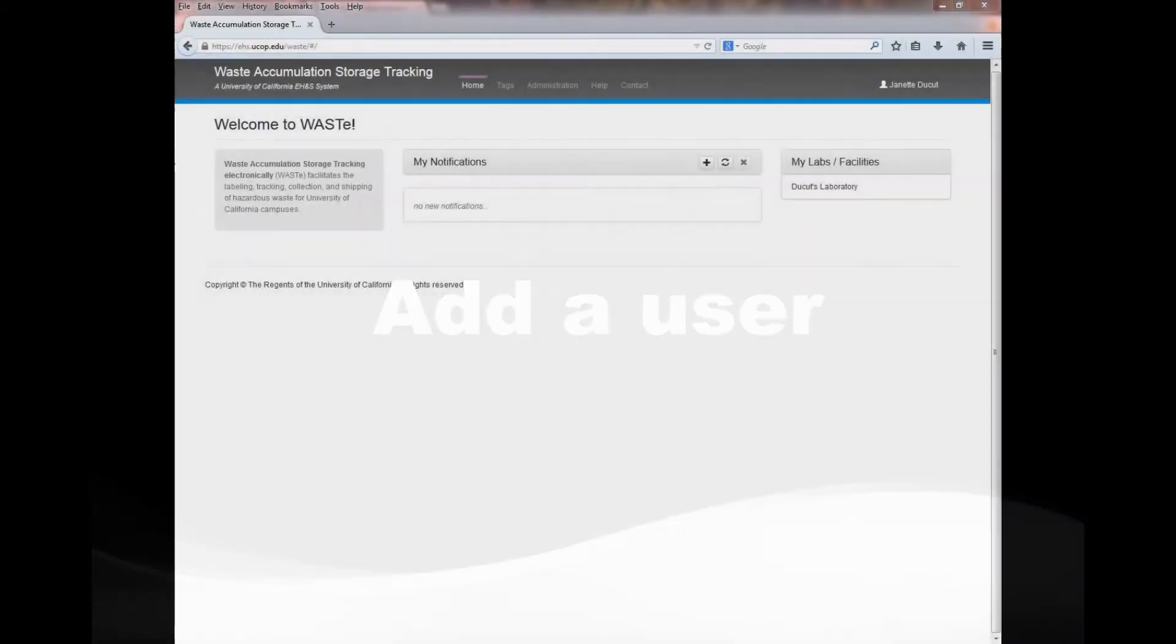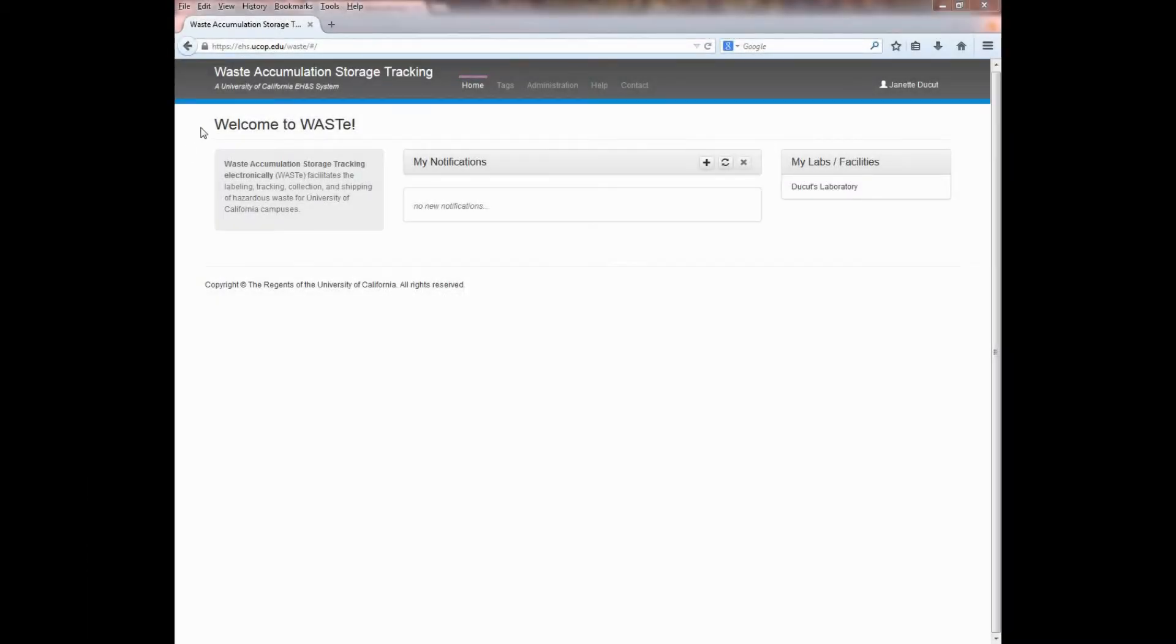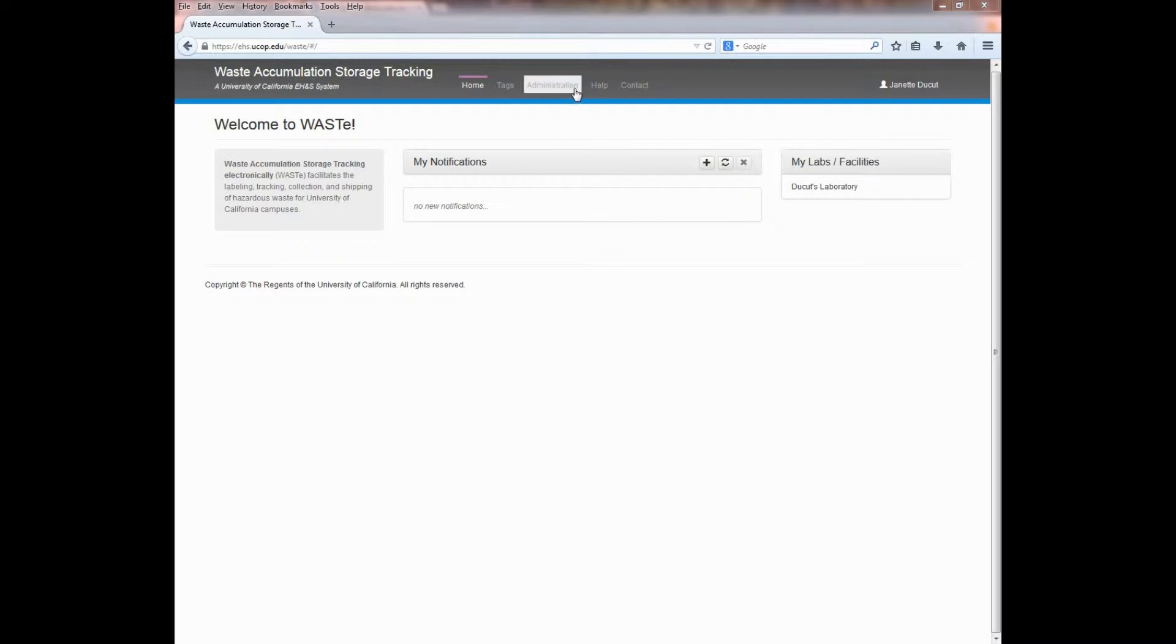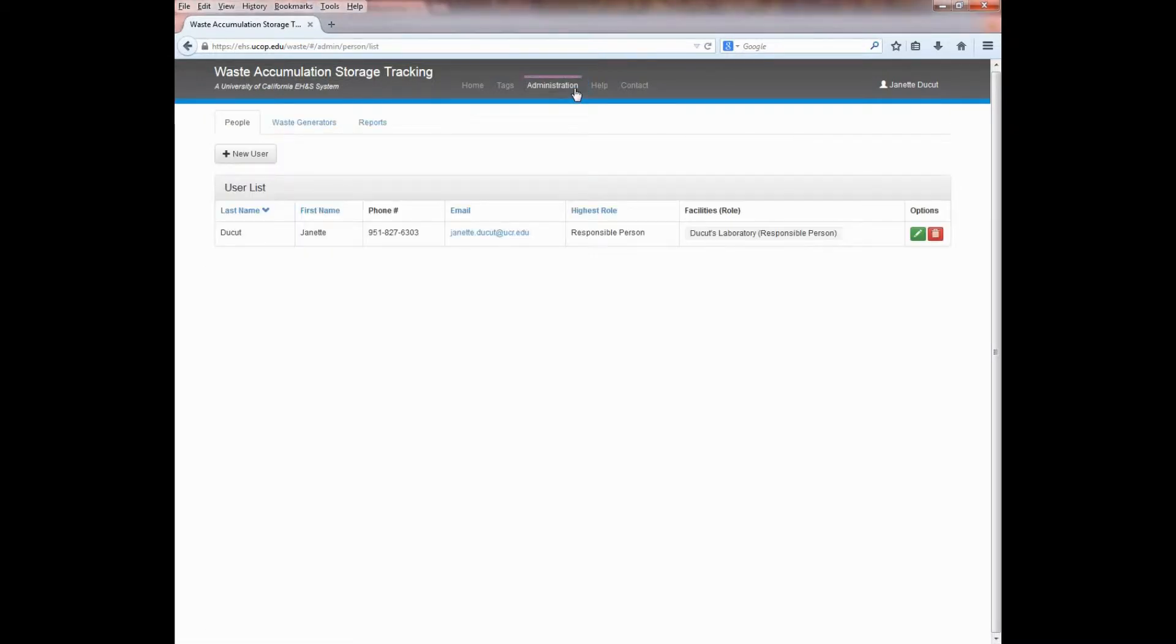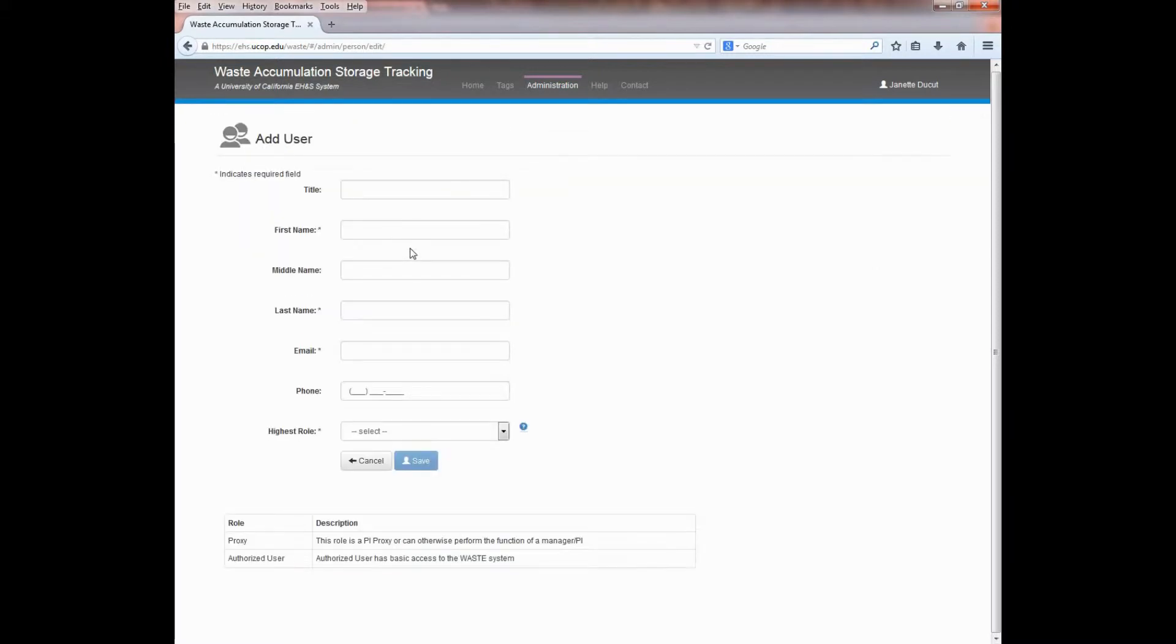As a responsible person or principal investigator, you can add users to your laboratory or facility. Please note that only users with a valid UC NetID and password will be able to use the system. To add a user, click on the Administration tab. Under the People tab, click on New User. When you get here, enter the person's name.